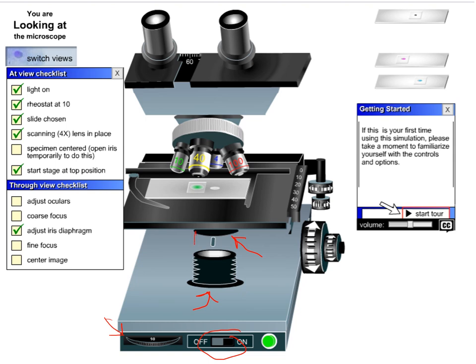You can play around with the diaphragm and see what effect it has on what you're viewing. This is actually quite a practical lab — useful if you ever have to use a microscope in another class. Students will often say they can't see anything, and the first thing you've really got to do is set the correct objective lens. You need to start with the low power, which is 4x.